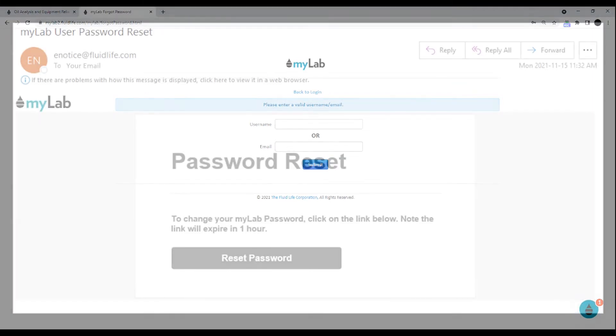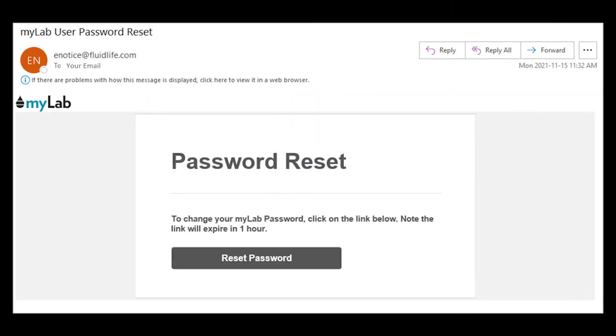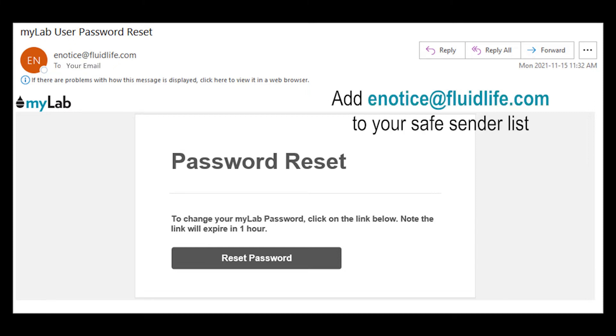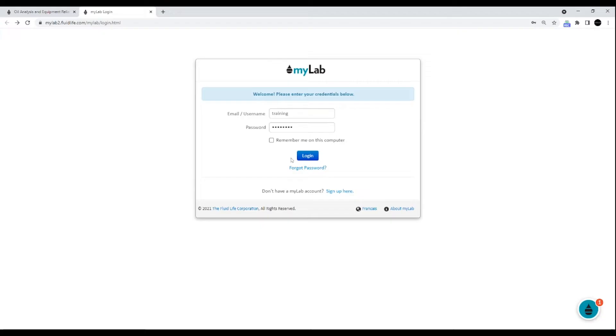An email with a reset link will be sent to your email from enotice at fluidlife.com. Check your junk or spam folder in case the email landed there. Add this email to your safe sender list. Now let's log in.